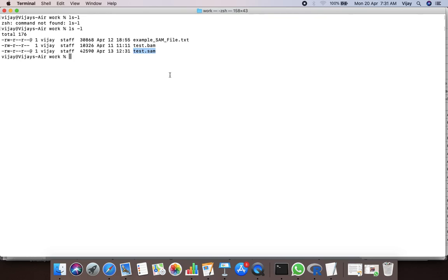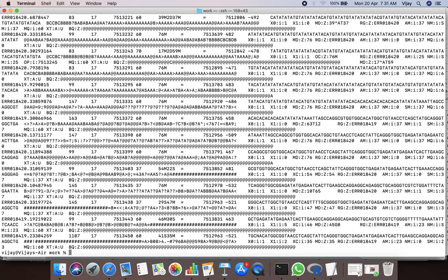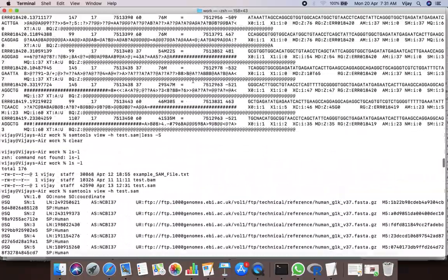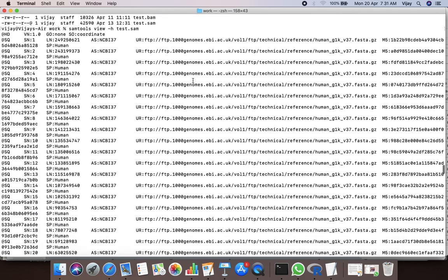In order to visualize the content of the SAM file, you can use SAMtools. The command is: samtools view -h then test.sam. This will display the content of the SAM file. This is how a SAM file looks like.